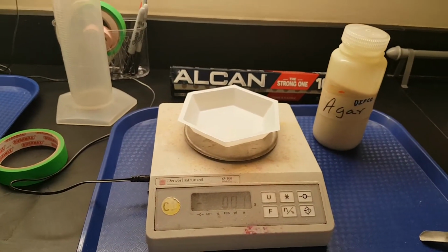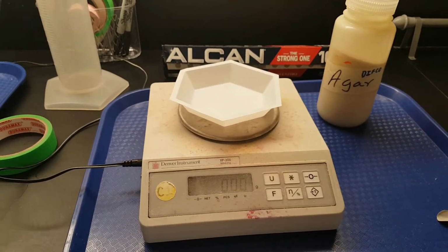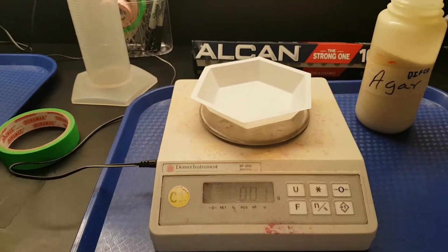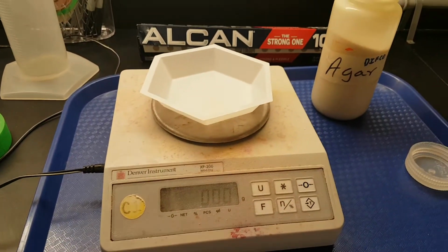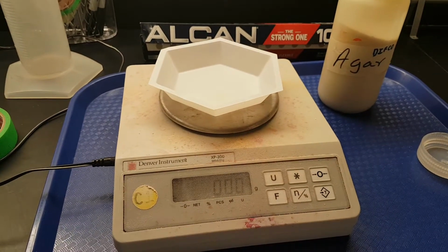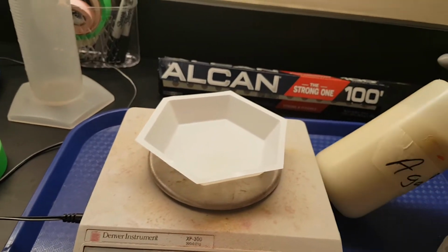We're talking about nutrients in agar that have been poured into petri dishes, and we'll see what that is like in a bit. But so to add the agar, usually for making plates, we want to use 1.5% of the amount of water that we're using, right? So if we're using 200 milliliters of water, 1.5% of that is 3 grams, because each milliliter is a gram.